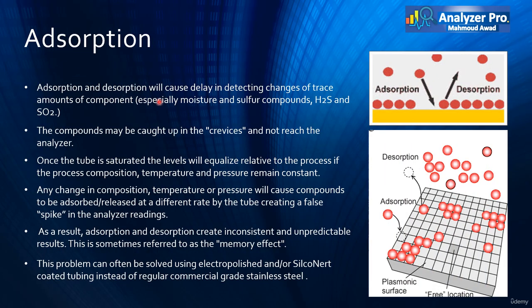Adsorption and desorption will cause delay in detecting changes of trace amounts of component, especially moisture and sulfur compounds, H2S, and SO2. The compounds may be caught up in the crevices and not reach the analyzer. Once the tube is saturated, the levels will equalize relative to the process, if the process composition, temperature, and pressure remain constant.